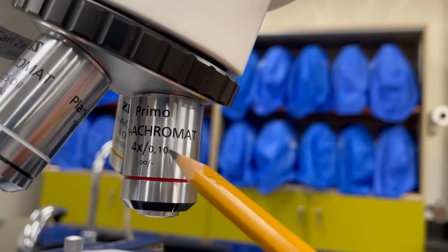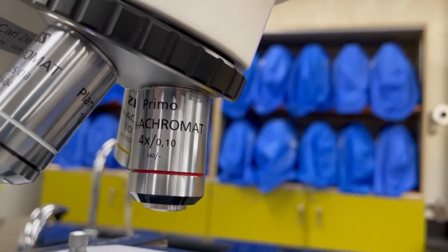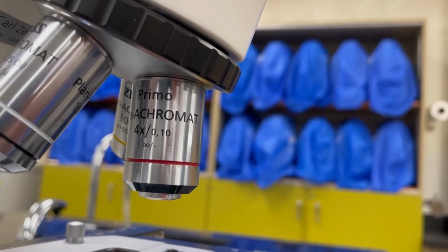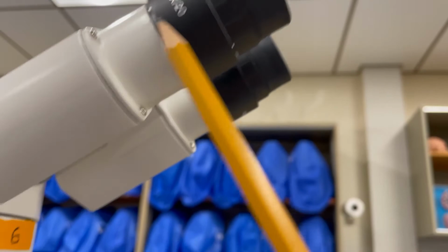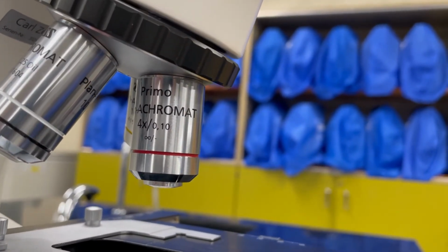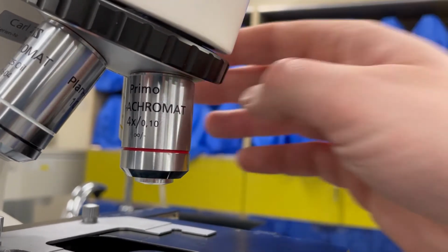It says 4 times, and over here that's the numerical aperture, so it says 0.10. And that's important for figuring out what your theoretical resolution is. So in this case, if we have a 10 times ocular lens and a 4 times objective lens, then 10 times 4 is 40, and that would be what you're viewing the specimen at.